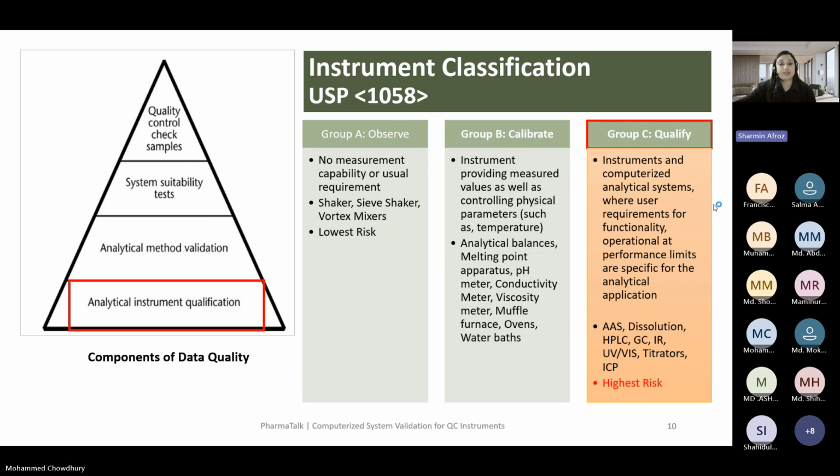Sometimes you can install the software first, but you have to approve your design specification before it goes into routine operation.